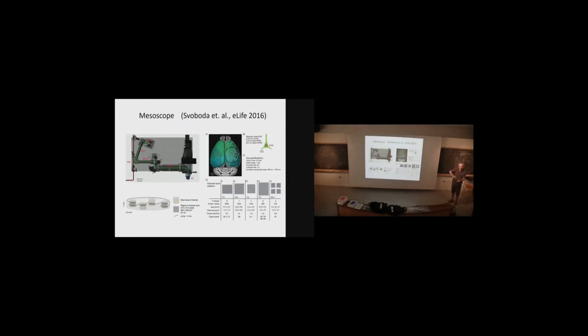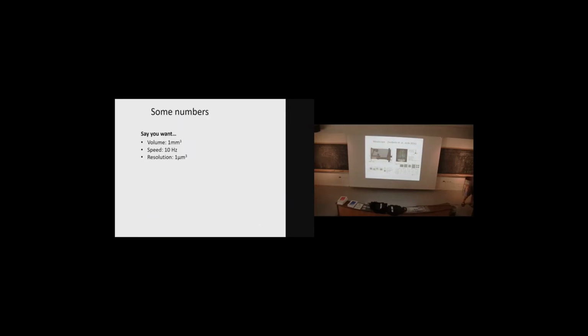And they could also shift up and down in Z and left and right, etc. So they could shift volumetrically and then get these tiled images over large volumes. So this was quite remarkable. This came out in 2016.